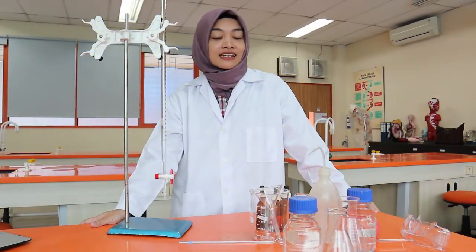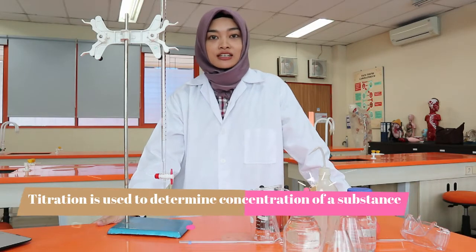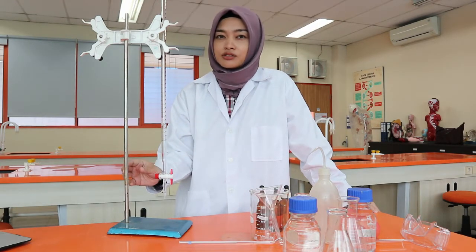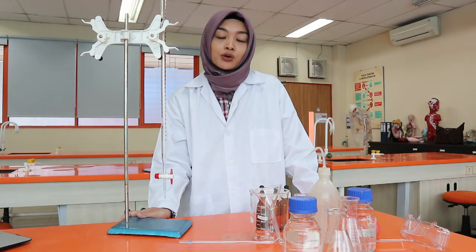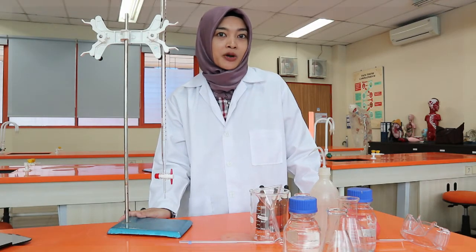Titration is an excellent way to determine the concentration of a solution. I have seen many high school students perform titration using a burette, but many of them don't do it correctly. As a chemistry and science student in general, it is very important to follow the correct procedure in an experiment to ensure accurate results. Remember, accuracy is very much needed in chemistry experiments.